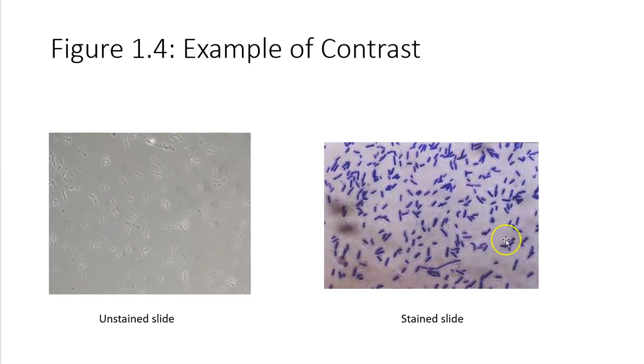And I try and tell people, when you use a single stain, a simple stain, and we'll talk about this, there's a difference in these stains. But when you use a simple stain, you can see the size and you can see the shape. But that's it. You can't tell anything else besides that. All right.